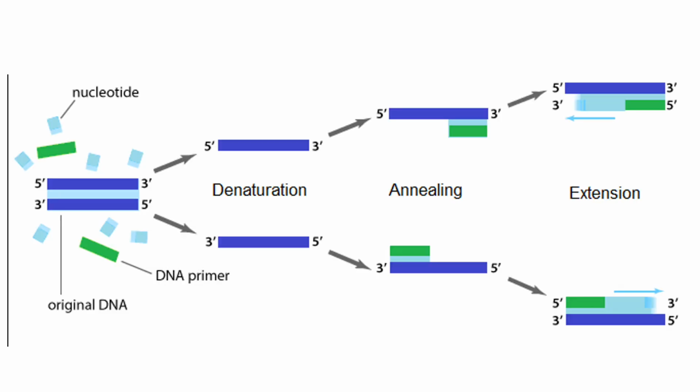This slide shows the overview of the different steps in PCR. The DNA strand is first denatured to become single-stranded molecules, then the primers anneal or bind to the ends of the single-strand DNA molecule through complementary base pairing. Then, the thermostable Taq polymerase elongates or extends the new strand until two new double-stranded molecules of DNA are formed at the end of the first cycle.